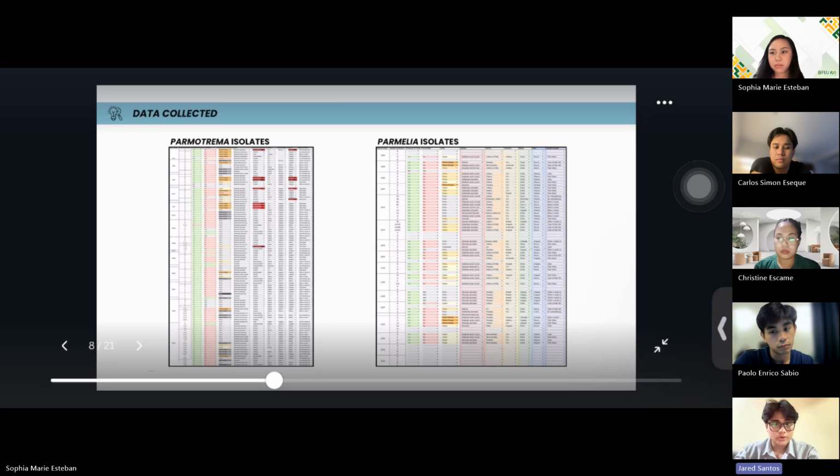Up until the recording of our presentation, we have a total of 254 subcultures tabulated in our online spreadsheet, comprising 21 Parmotrema parent plates and 20 Parmelia parent plates, producing 118 Parmotrema subcultures and 105 Parmelia subcultures. Next slide, please.